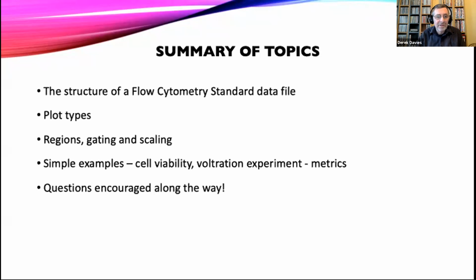So I'm going to cover cell viability, and then Kathy is going to actually take some of the data that we generated in one of the previous courses, or at least some data that's very similar, and look at how we assess the correct voltage to set on the systems where we can set voltages. And as we said, questions are certainly encouraged all along the way. So Kathy will be monitoring those while I'm speaking, and vice versa. So let me stop the share at that point.